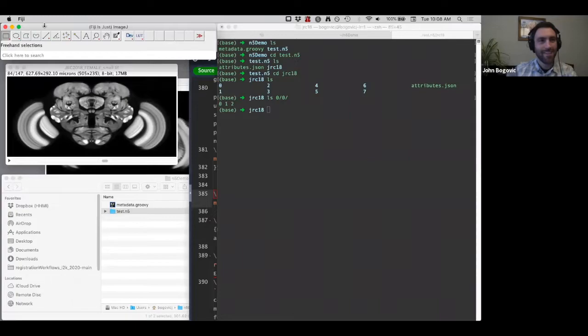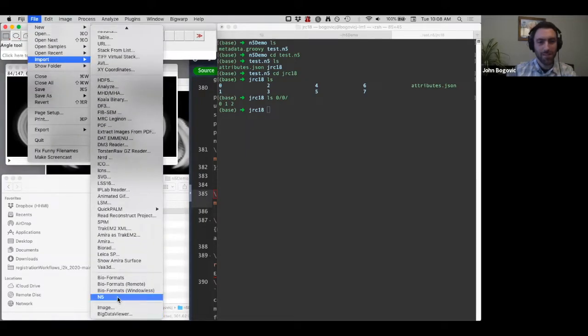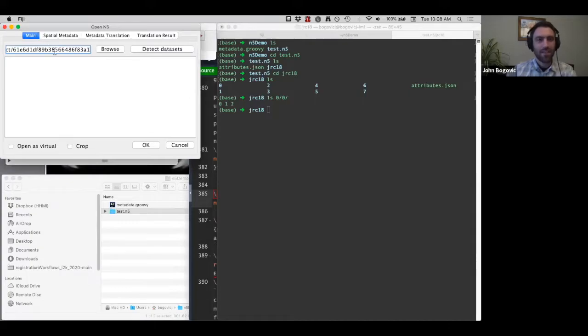And it's important that if we write them, we should also be able to load the data again, right? So we'll just make sure that what we just wrote can be opened again. And that's not what we want.